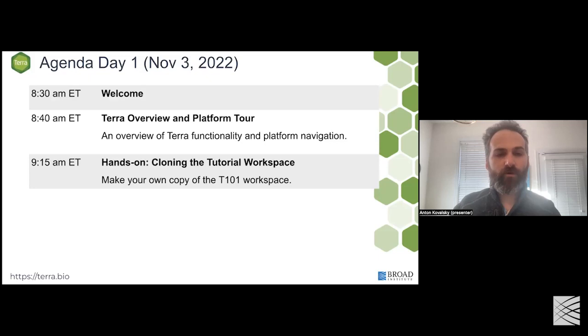As a quick reminder of what we went over last time, we had a Terra overview. We did a little overview of why Terra exists and what it does, and we gave a tour of the platform, just an overview of the various pieces of functionality. And we had a brief hands-on demonstration of just cloning a workspace. We're actually going to do exactly the same thing today in terms of cloning the workspace. That's what we're going to start with as soon as we get to the hands-on portion.